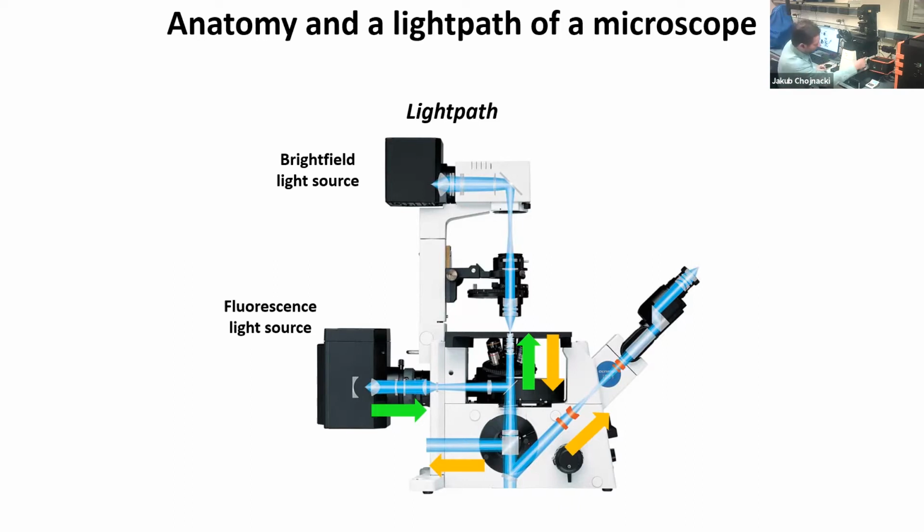In this microscope, that is exactly what happens. We can send the fluorescent light to the ocular, to our eyes, or to this element here, which contains machinery to send it to the main box of the microscope, which contains all the detectors.